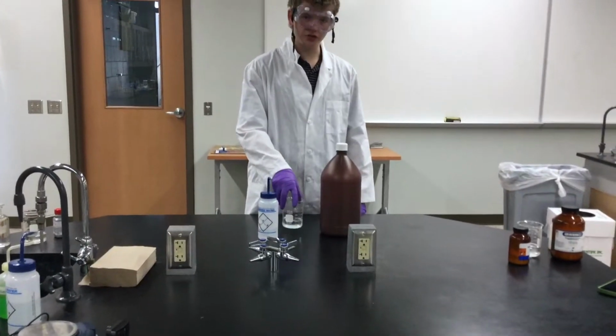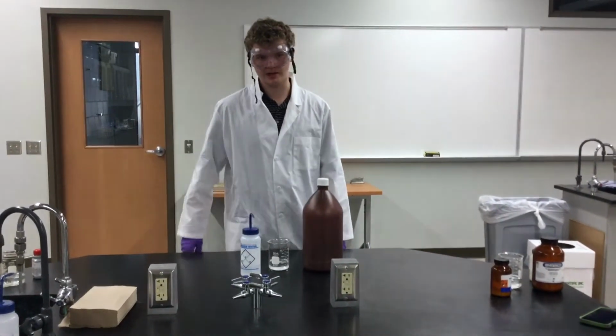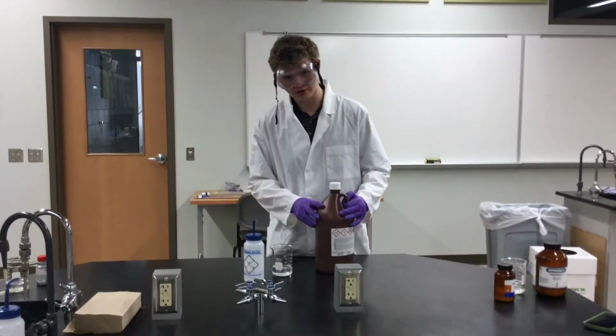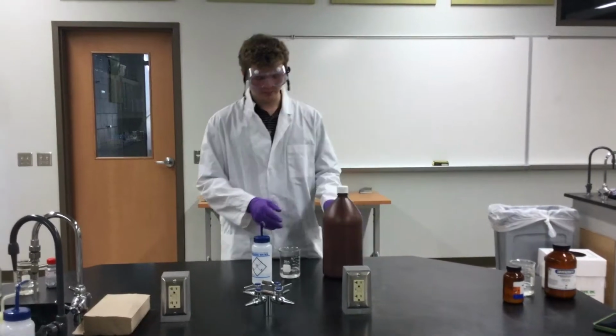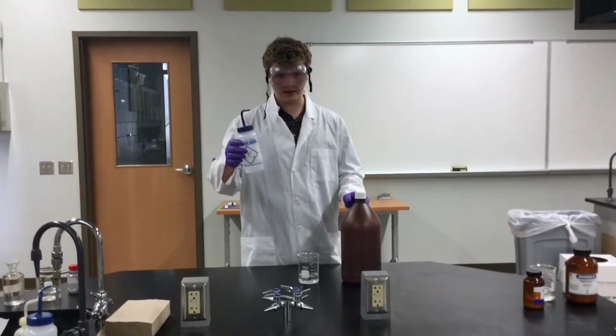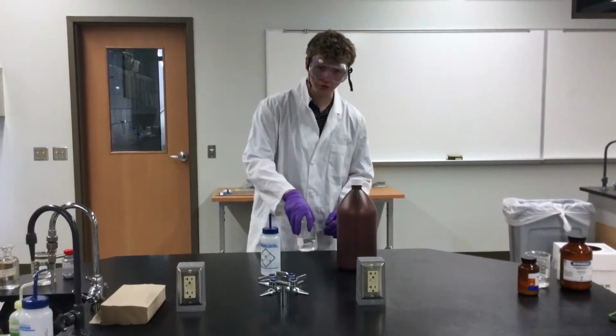Here we have solution A, which is 100 milliliters of 9% hydrogen peroxide. You can make this by taking 30% hydrogen peroxide, measuring out 30 milliliters of it, and then adding deionized water until you get to 100 milliliters, leaving you with solution A.